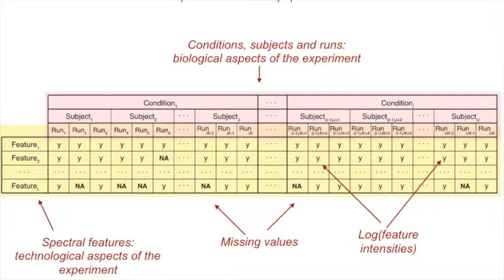And for this particular protein, you will have no information in this run. So is it 0 on A? Then you just have to fill in the blank yourself, right? And okay, let's call it an A, right? But it's probably because the protein was not found in this run. So it's probably still appropriate to think that it's censored, right?